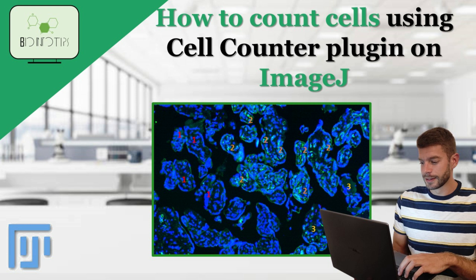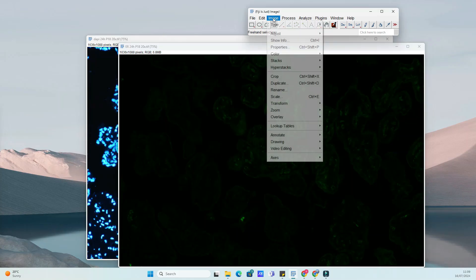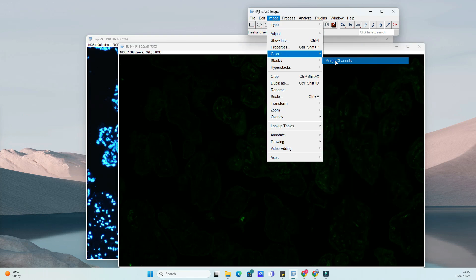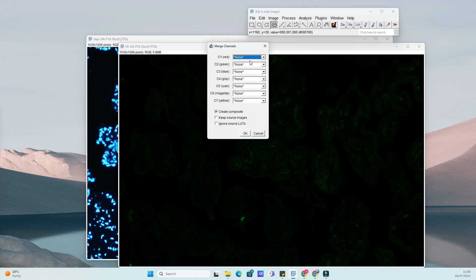In today's tutorial, we're diving into a powerful tool for cell analysis in ImageJ, the Cell Counter Plugin.